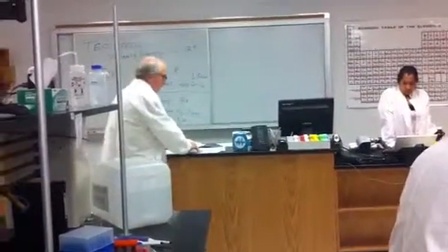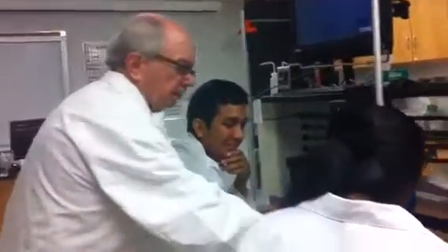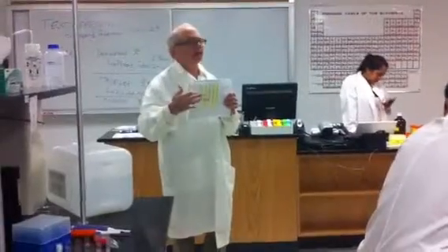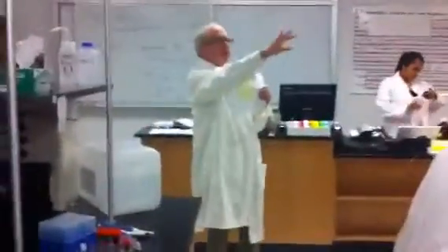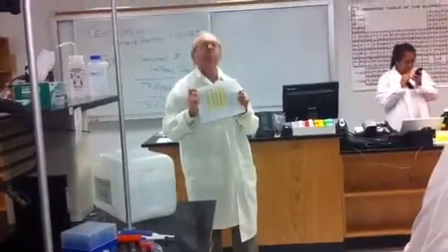I have then on sheet 3, and I think that you have sheet 3. That's not a good print. Yeah, that is. But the point about sheet 3, look at this. Sheet 3 is after you've done that collection on sheet 1. The data collected, raw data, as you're writing it, as you're keying it in, is on sheet 1. Now sheet 3 is how the result page will look back at me.